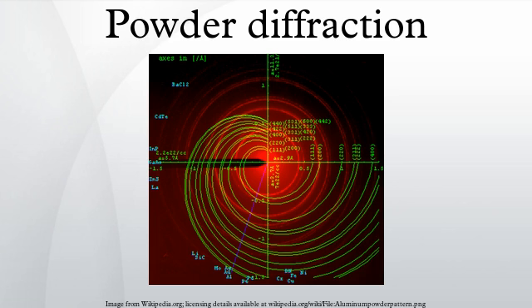As neutrons also have a magnetic moment, they are additionally scattered by any magnetic moments in a sample. In the case of long-range magnetic order, this leads to the appearance of new Bragg reflections. In most simple cases, powder diffraction may be used to determine the size of the moments and their spatial orientation.